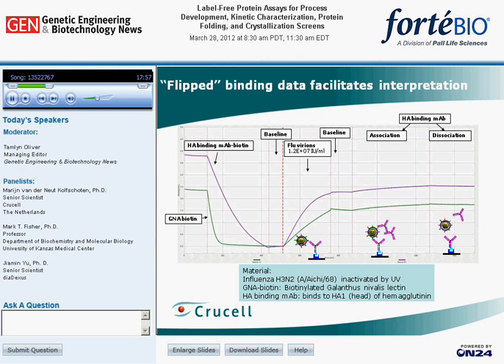In the analysis software of the Octet, negative binding curves can be flipped, converted from negative into positive binding, which makes the interpretation of such data easier. Also, we have some indications that binding of antibodies on top of the captured virions is possible, but this needs some more investigation. Next slide.